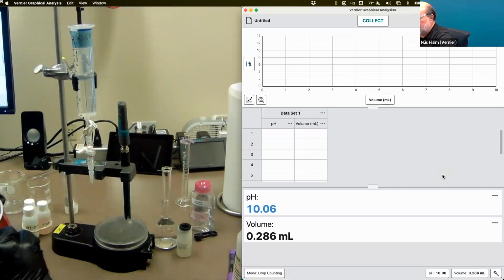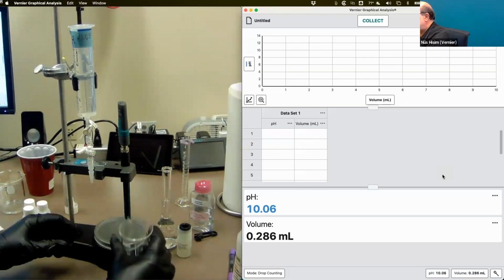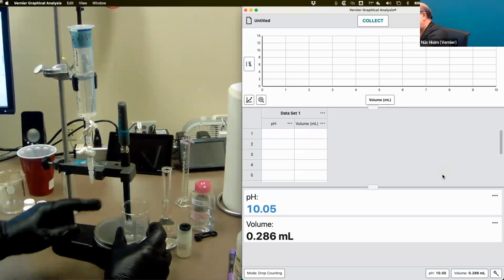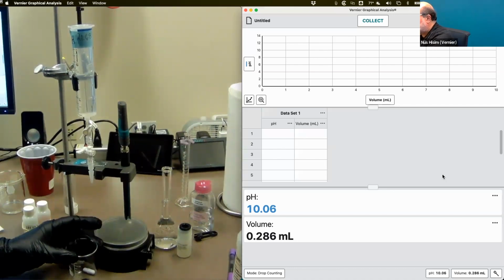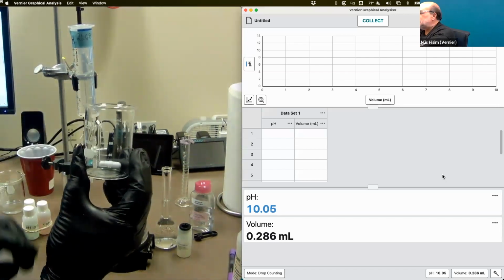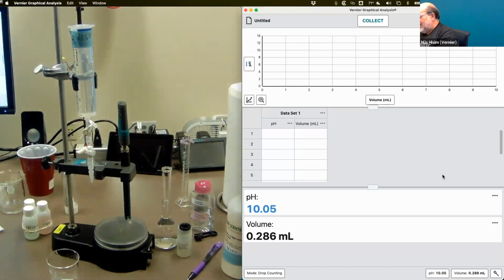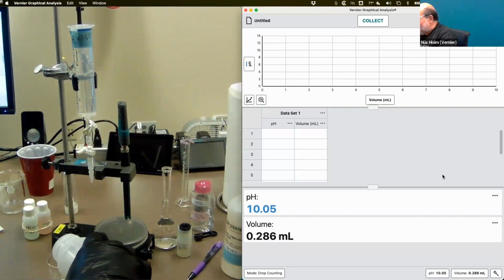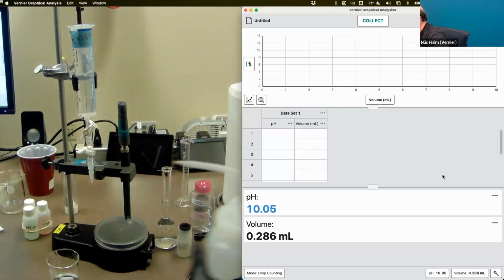Now we need to get the sample ready. So what we're going to do is you can kind of see, we're going to put the pH probe in here, and there's going to be the sample, but we're going to need to dilute it. In the experiment, if you're using this size beaker, I said use 40 milliliters of distilled water. That is not critical. And boy, will this cause some consternation in your students. It's like, what? It doesn't make any difference how much water I put in here? So, start talking about moles and mole ratios, all those kind of fun things, right?